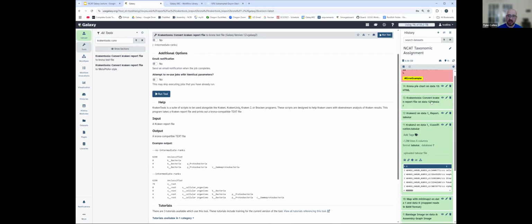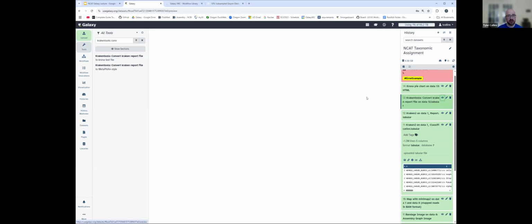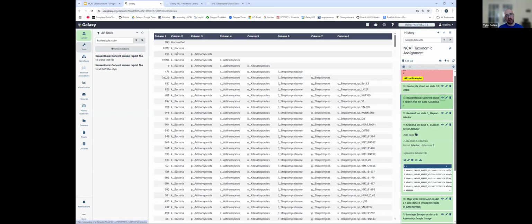So when we ran it, that will be here in item 13. You can see that the table we had before becomes a bit clearer, where we still have a number count, and then a kingdom column, a phylum column, a class, order, family, and we'll go down showing the counts of each as we move.